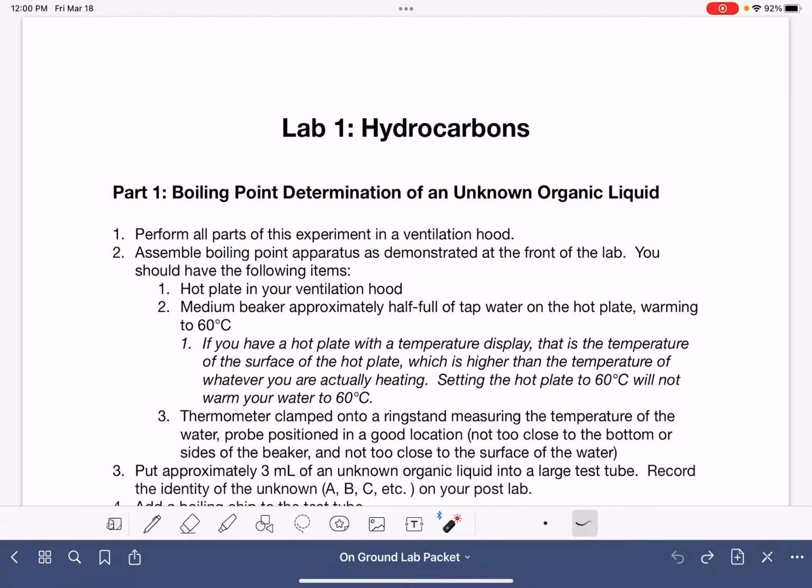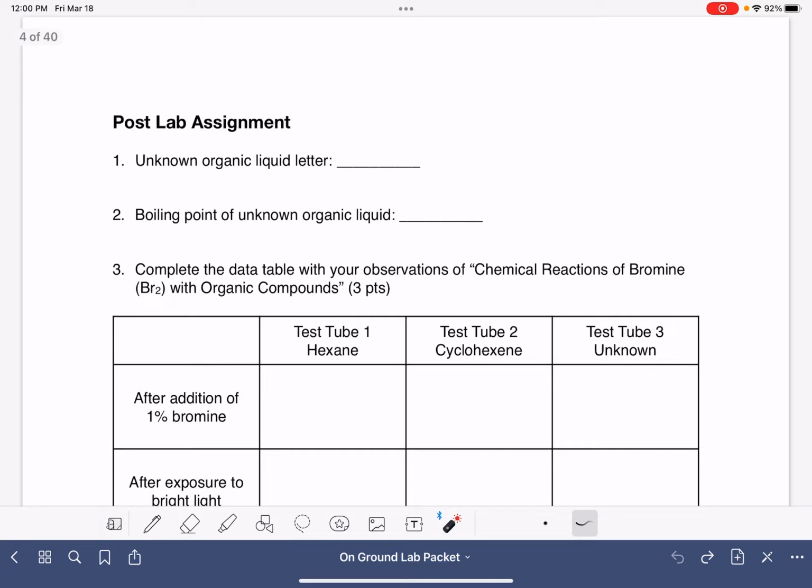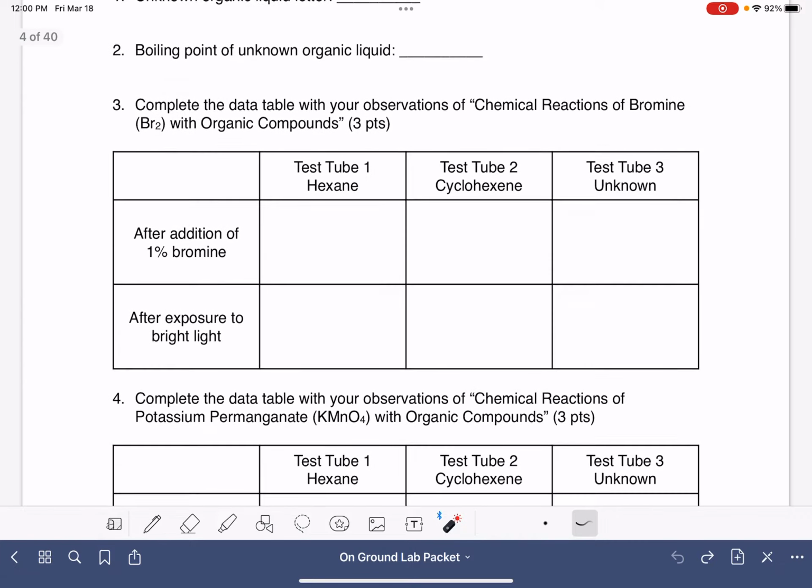In this video, I'm going to give you some tips for the post-lab assignment for Lab 1, Hydrocarbons. The first problem, you'll just be recording the letter of the unknown that you selected, and question number 2 is just the boiling point as you measured it in the lab.